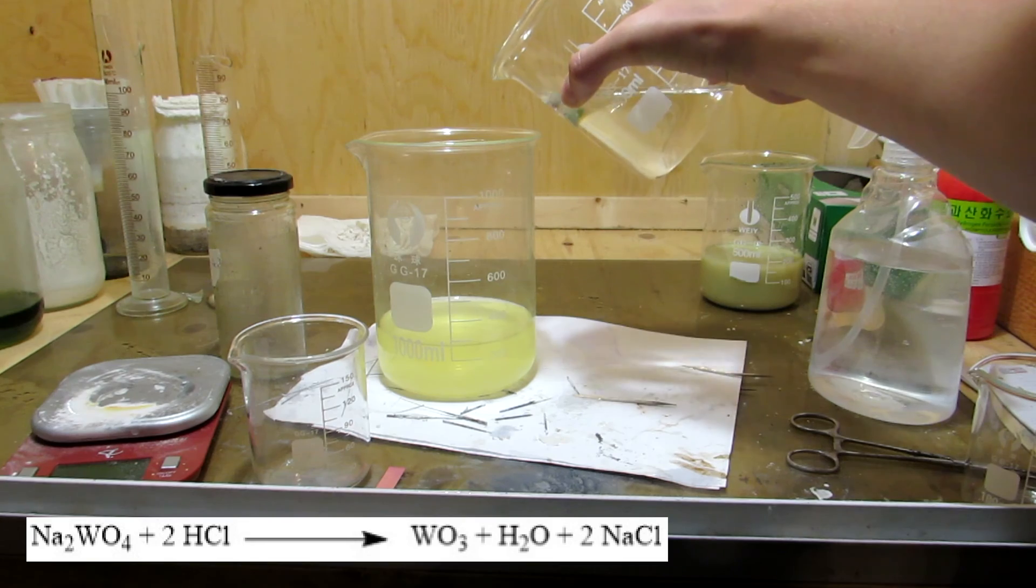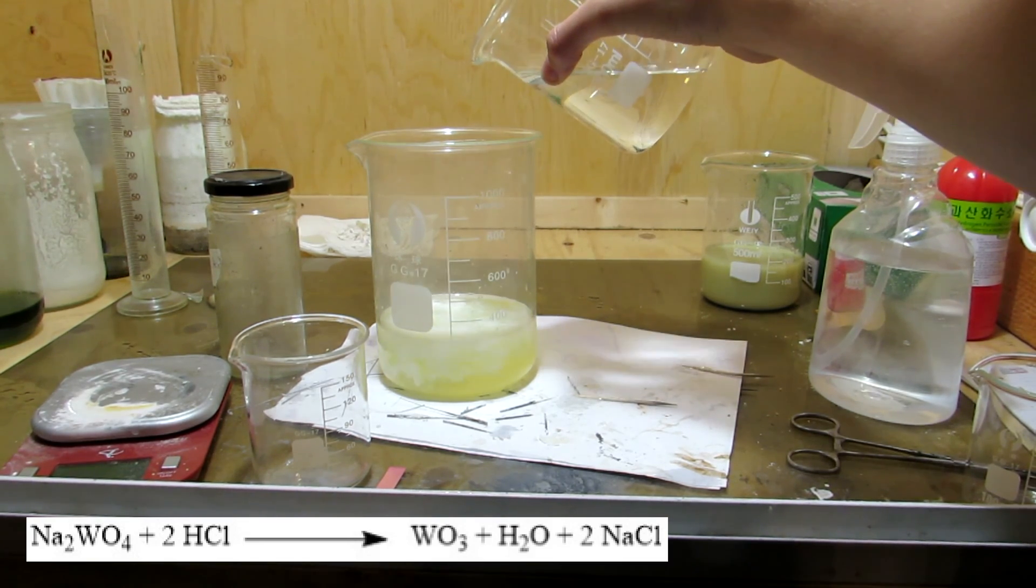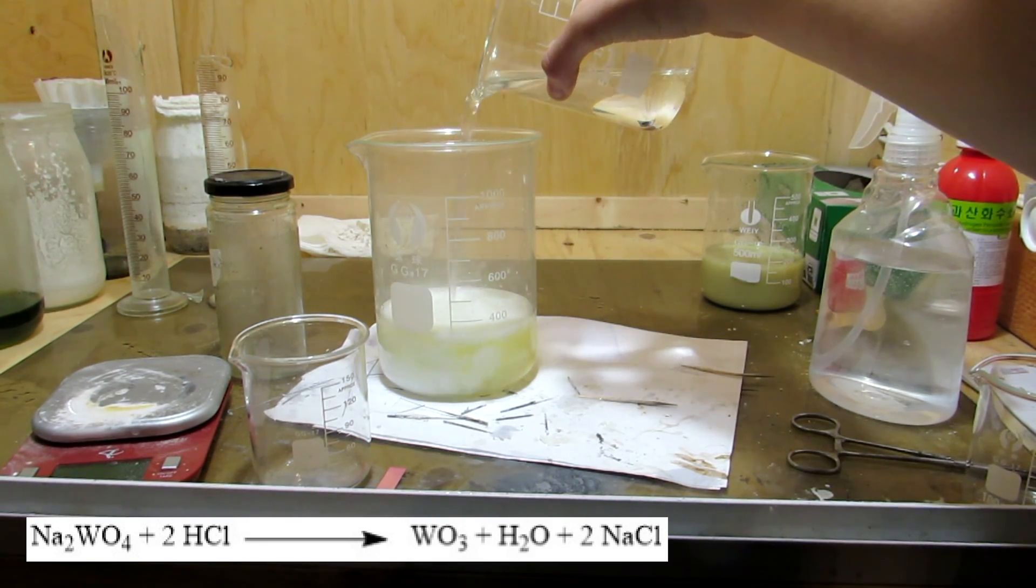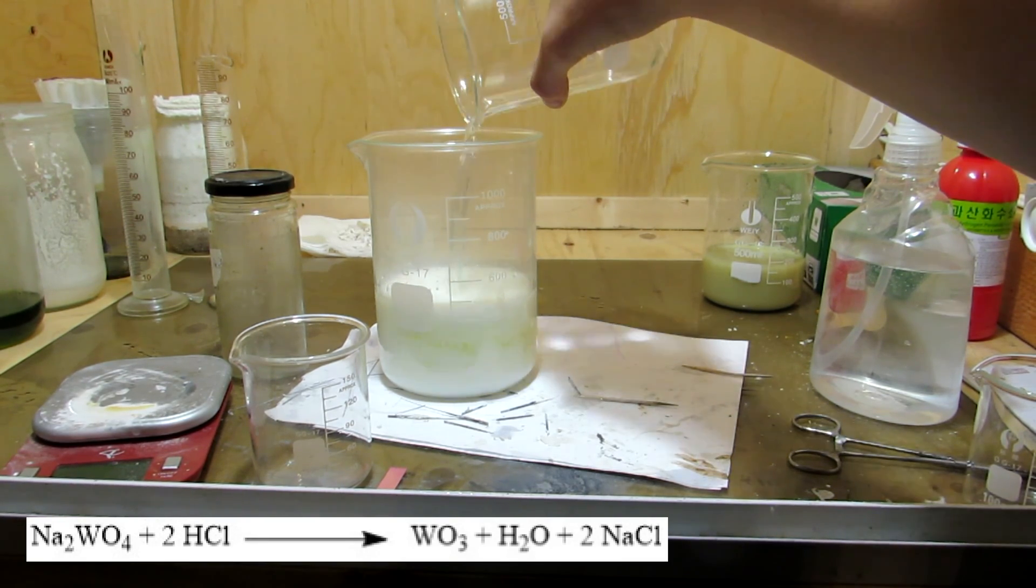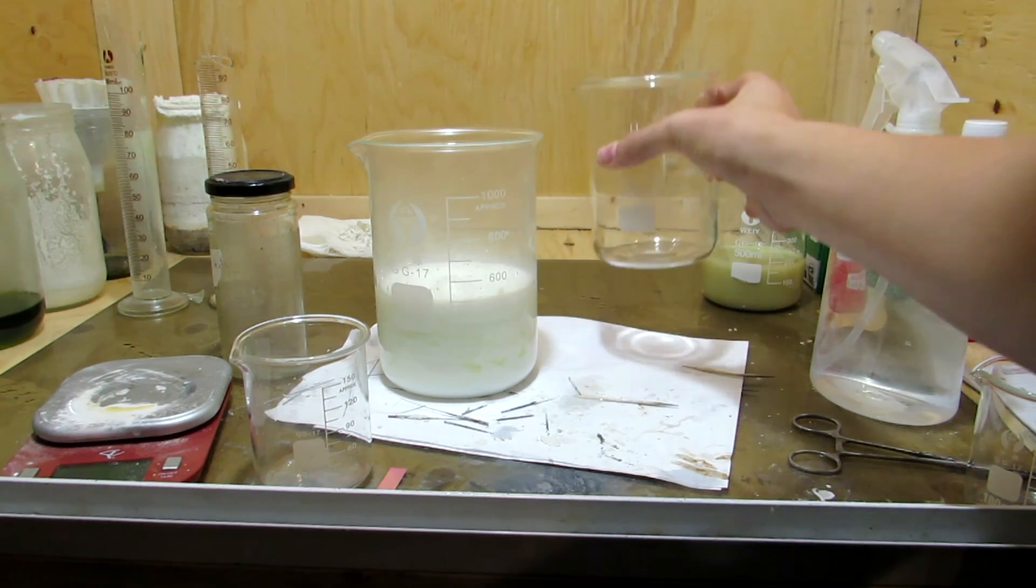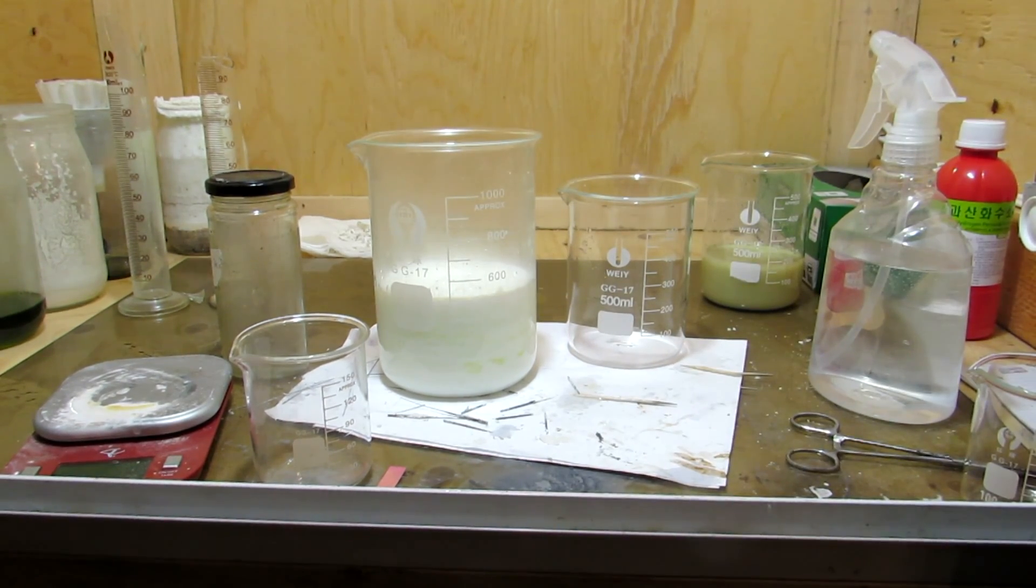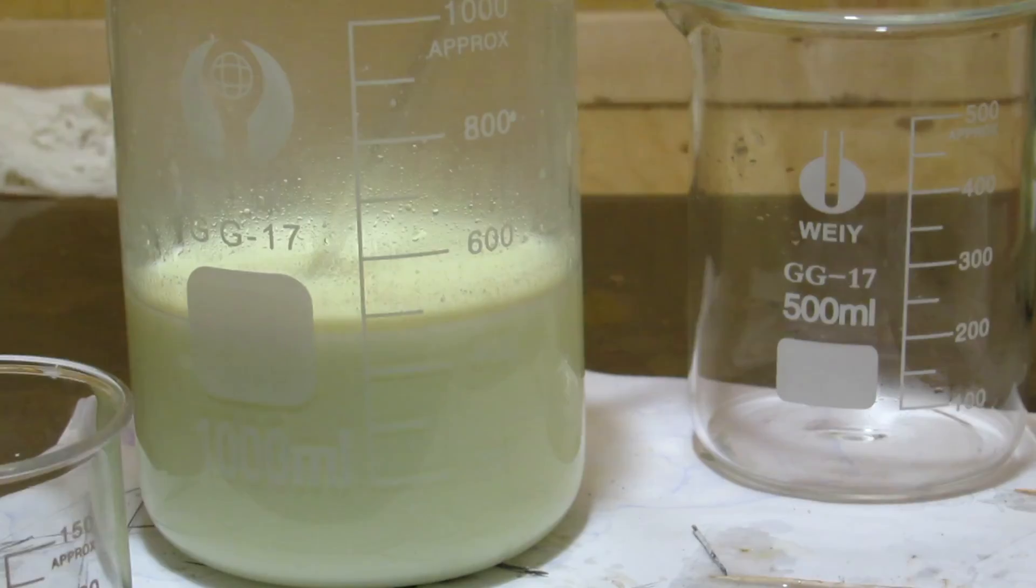Next, we can add about 200 milliliters of concentrated hydrochloric acid to convert the sodium tungstate to tungstic acid, which precipitates out. Concentrated hydrochloric acid can be purchased from hardware stores as muriatic acid. Interestingly, the precipitate was initially white, even though the tungstic acid is yellow.